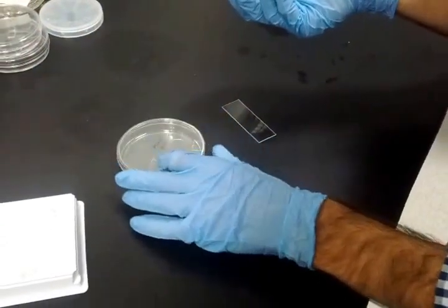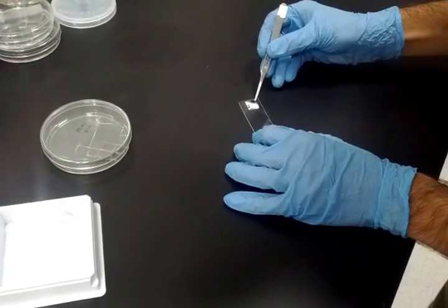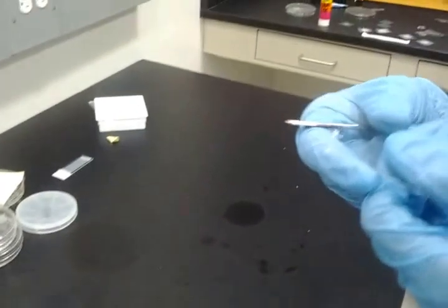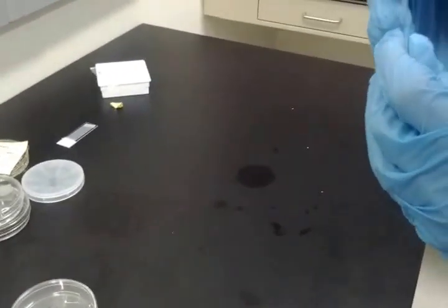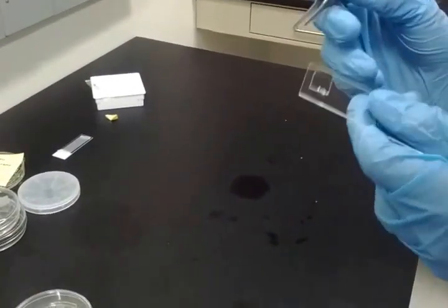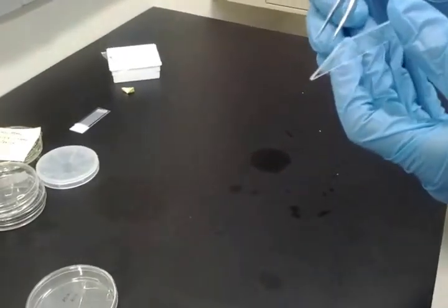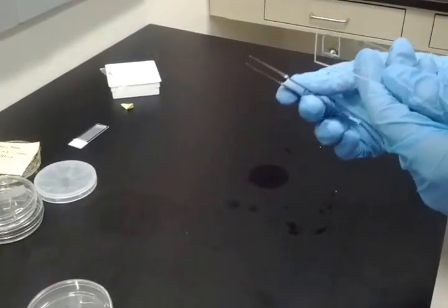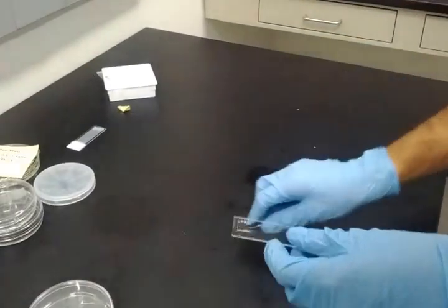This one seems pretty thin, maybe 1 millimeter or even thinner. So it's better not to have any kind of bubbles here, because that will not make the surface flat and it's difficult to search for flakes and difficult to transfer. There is also an area that, for some reason, looks like a drop that was frozen there. It's okay for our purpose. I'm just going to exfoliate vertically, so that won't be a problem.